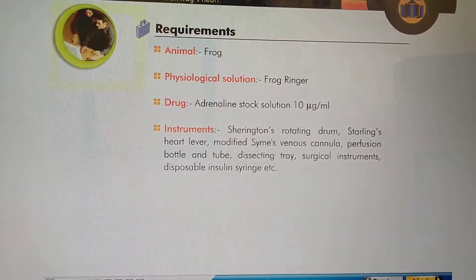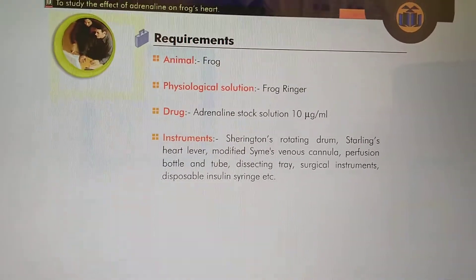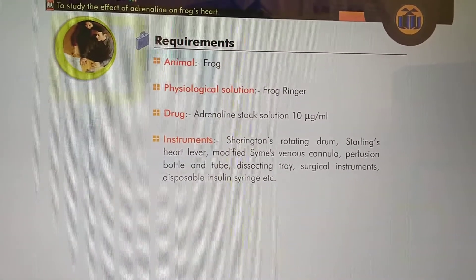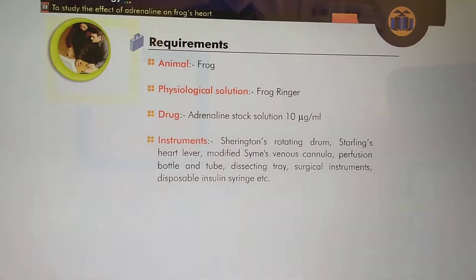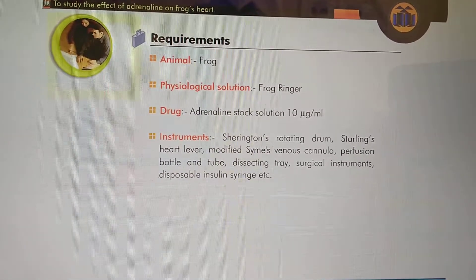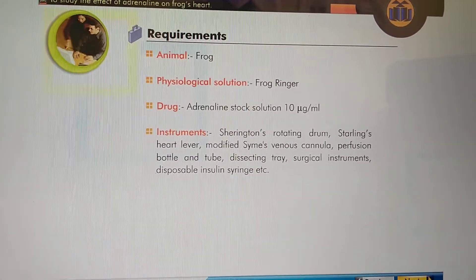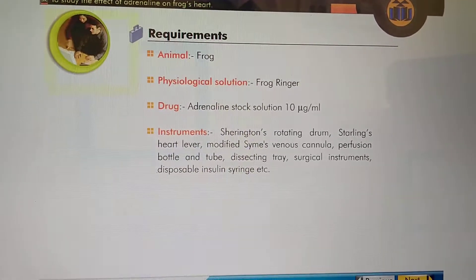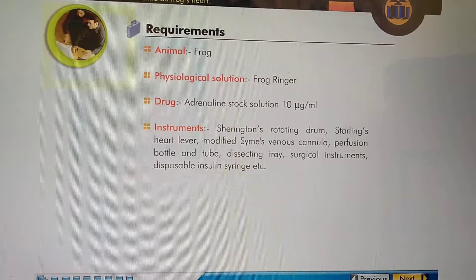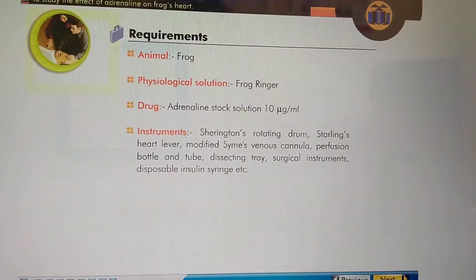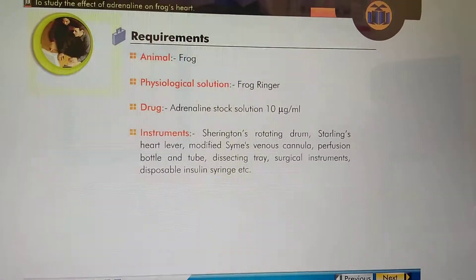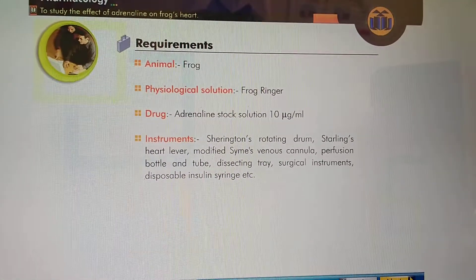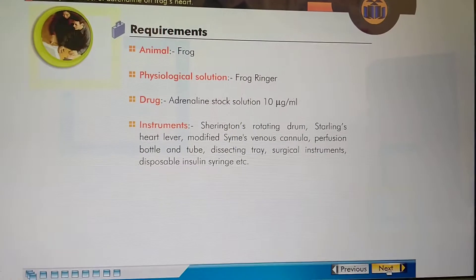The animal used is a frog. The physiological solution is frog Ringer's solution, and the drug used is Adrenaline stock solution at 10 micrograms per ml. The instrument setup is the same as used in the isolation technique of frog heart.